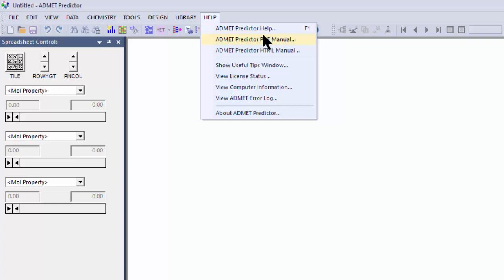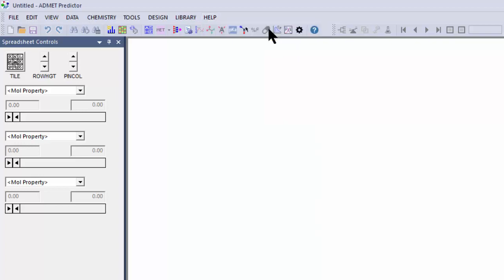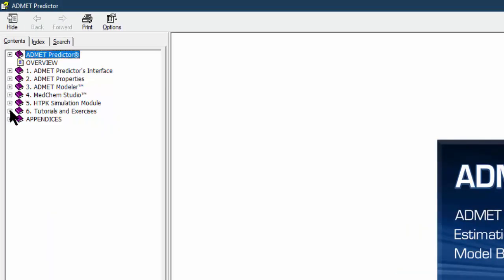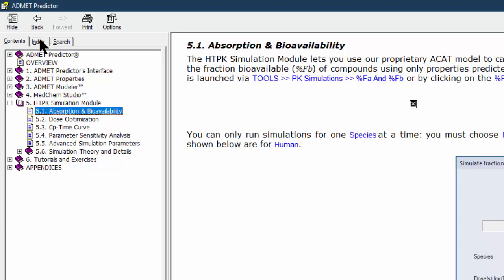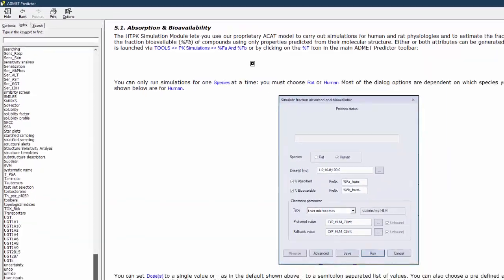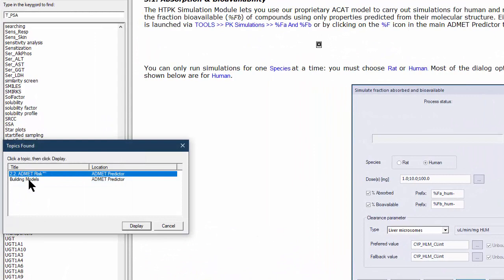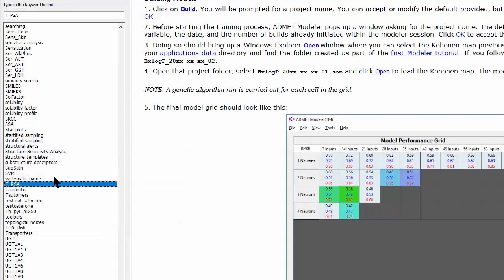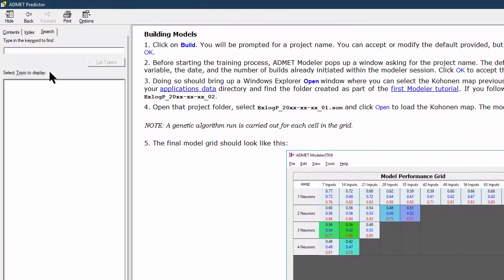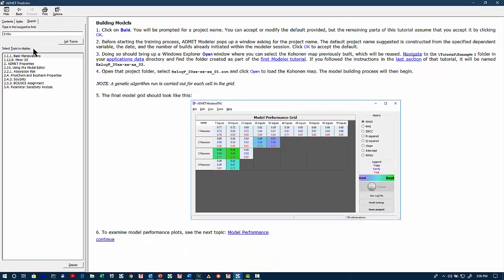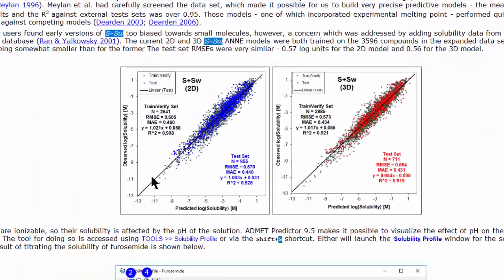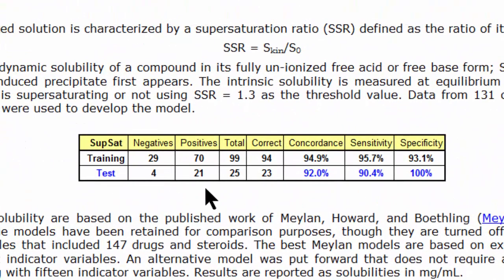With our Help menu, we have three options to view the user manual. The first one is the standard Microsoft Help file. You have contents listed here; you can open these and go to a specific section in the manual. We have an index, which would be typically towards the back of a user manual. You can double-click on a topic to display information associated with the index. You can also perform searches, such as S plus SW, which is our solubility model. For each of the models in Admet Predictor, you get an observed versus predicted plot along with the statistics for regression models. For classification models, you'll get information about the size of the training set, the number of positives, the total number of compounds, total correct, and then the concordance, sensitivity, and specificity for each one of those models.